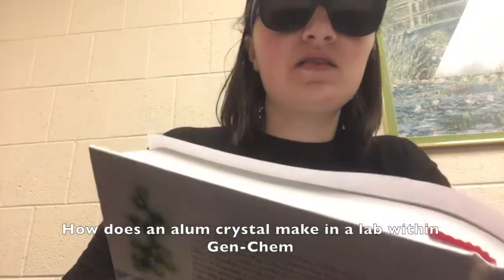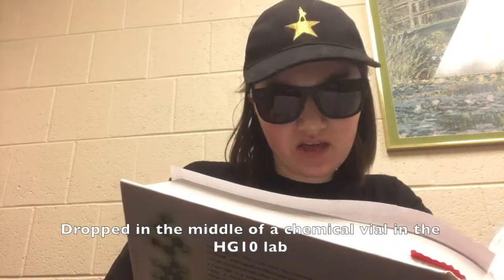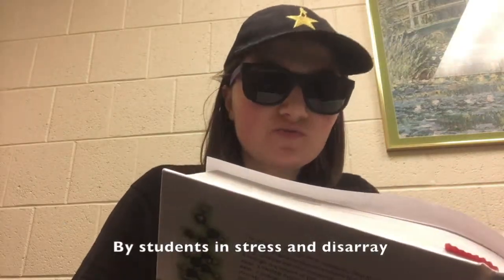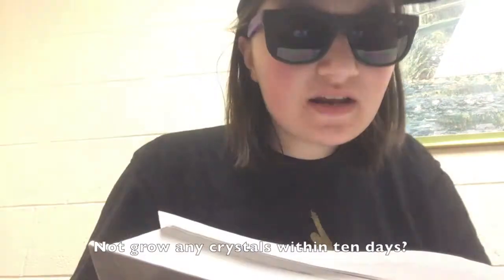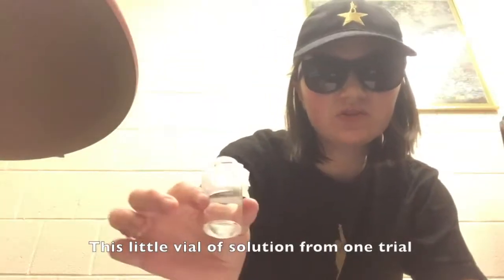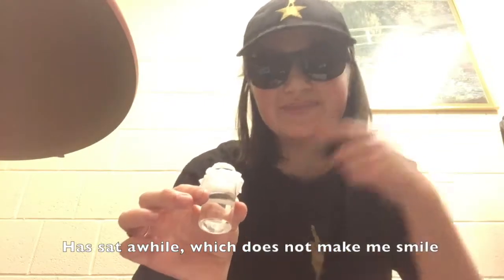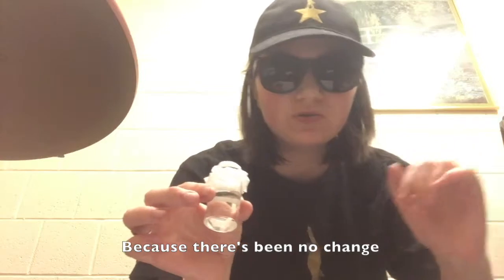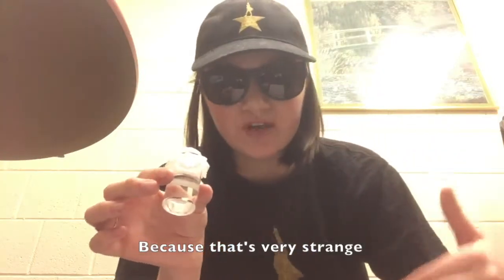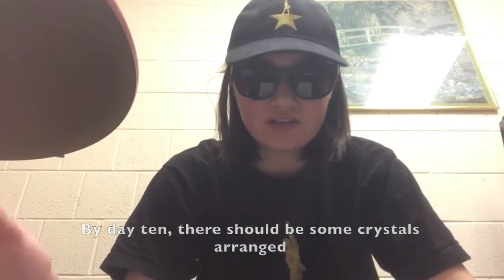How does an alum crystal made in a lab within Gen Chem, dropped in the middle of a chemical vial in the lab by students in stress and disarray, not grow any crystals within 10 days? This little vial of solution from one trial has sat a while, which does not make me smile, because there's been no change, and that's very strange. By day 10 there should be some crystals arranged.